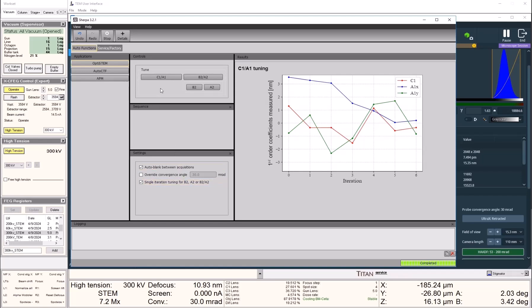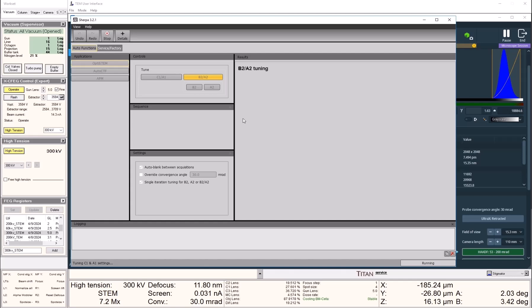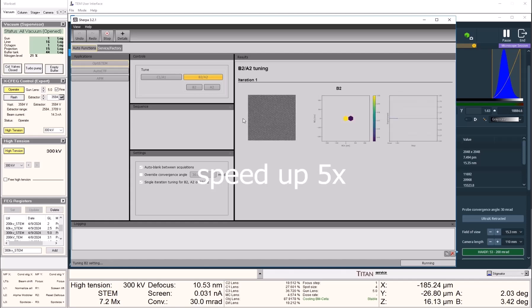This process usually takes a few minutes, as the software finds the optimum solution for B2 and A2 respectively. It is going to start the algorithm by tuning C1 and A1 one more time. When it comes to the stage of tuning A2 and B2, a very nice feature here is that it returns a plot showing you the progress and what the image quality is like at each step.